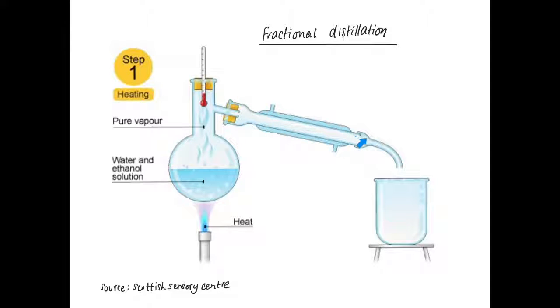It will flow down the condenser. And then in here, we'll get pure ethanol.